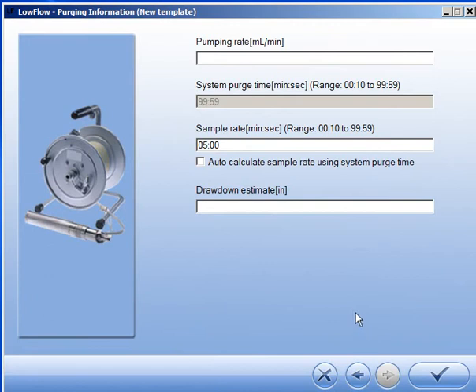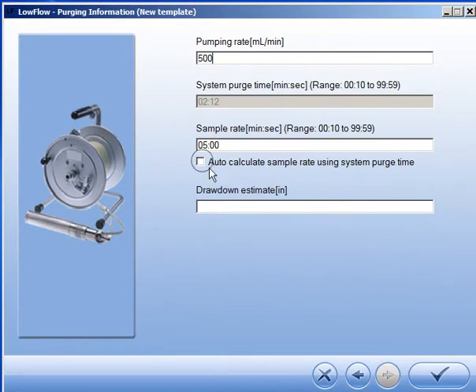This screen allows you to enter well purging and sampling information. Select the checkbox if you would like the software to calculate the sample rate for you.